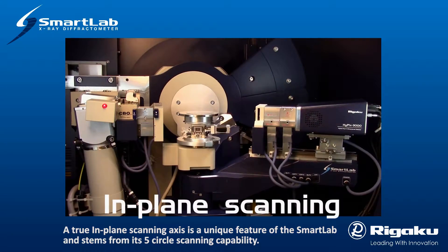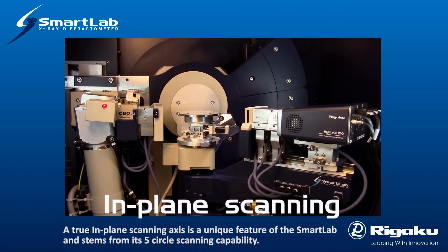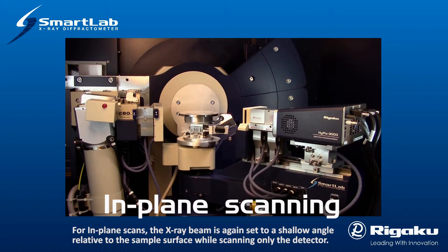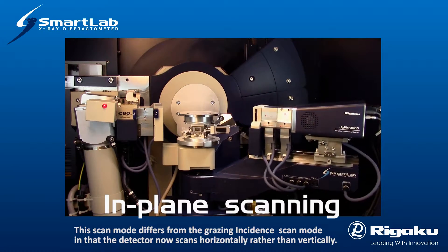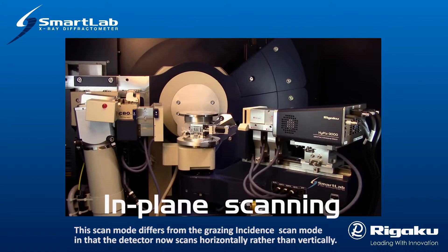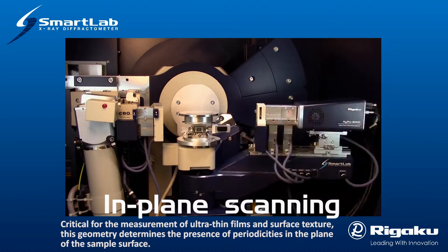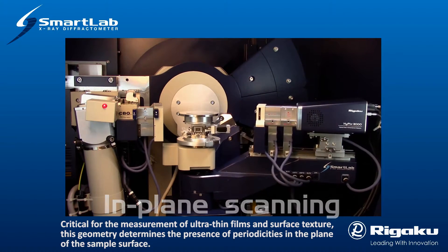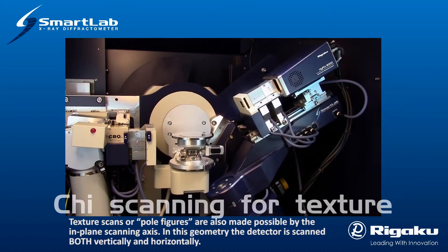A true in-plane scanning axis is a unique feature of the SmartLab and stems from its five-circle scanning capability. For in-plane scans, the X-ray beam is again set to a shallow angle relative to the sample surface while scanning only the detector. This scan mode differs from the grazing incident scan mode in that the detector now scans horizontally rather than vertically. Critical for the measurement of ultra-thin films and surface texture, this geometry determines the presence of periodicities in the plane of the sample surface.